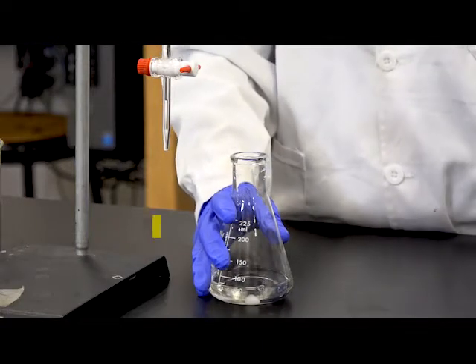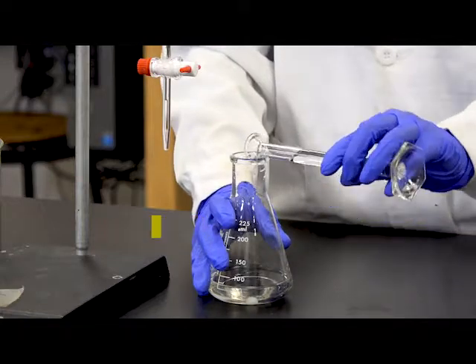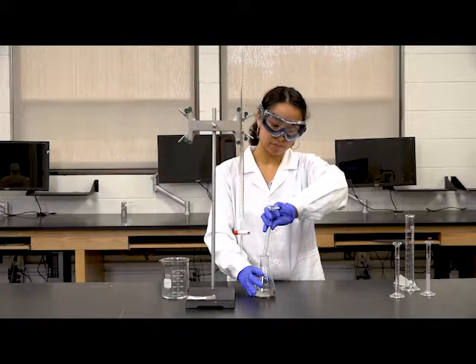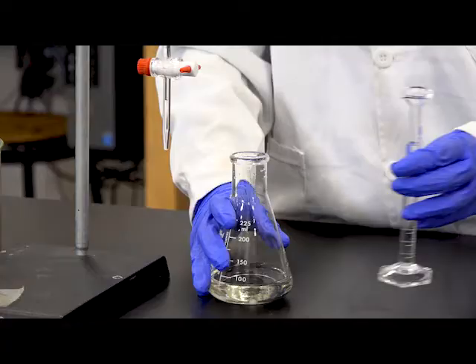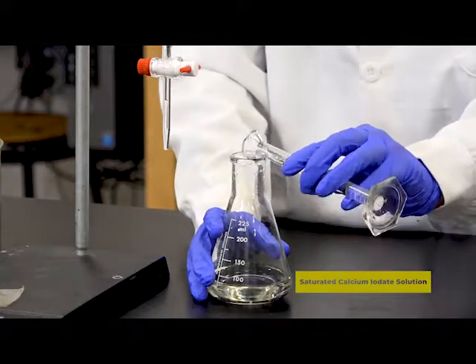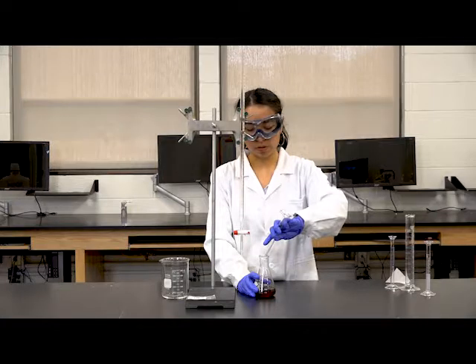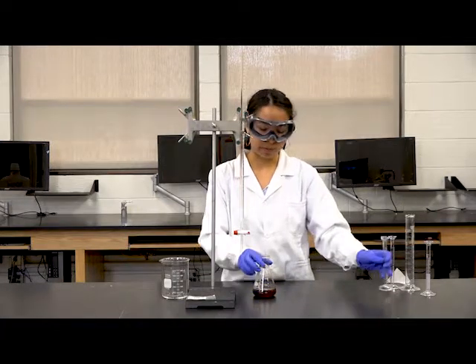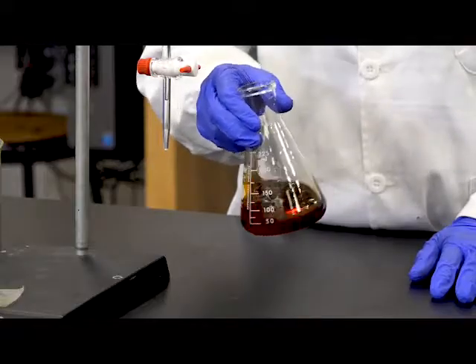After that, get your HCl, hydrochloric acid, and add it to the flask. Finally, you're going to add a saturated solution of calcium iodate in water, and your solution should turn a reddish-brown color. Make sure that you mix the solution well before starting the titration.